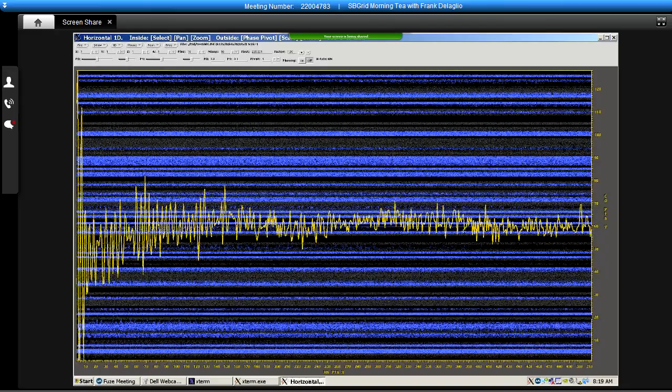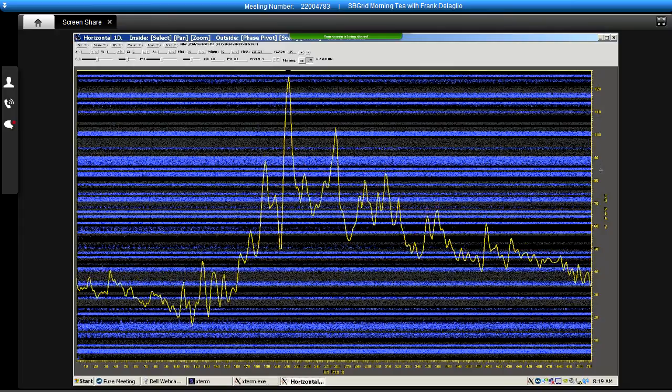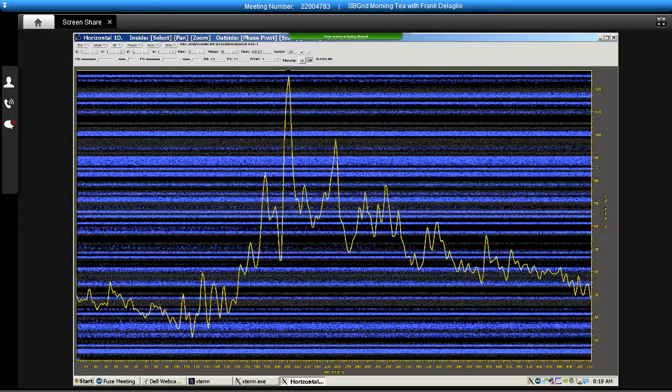So here's the first 1D vector from the first plane in the time domain data. We can use this to choose phase correction parameters, but of course we have to turn it into a spectrum. And a convenient way to do that is in the process menu through a command called auto process 1D. And that will apply a predefined collection of processing functions that include a window function, zero fill, and a Fourier transform. And we get a result like this.